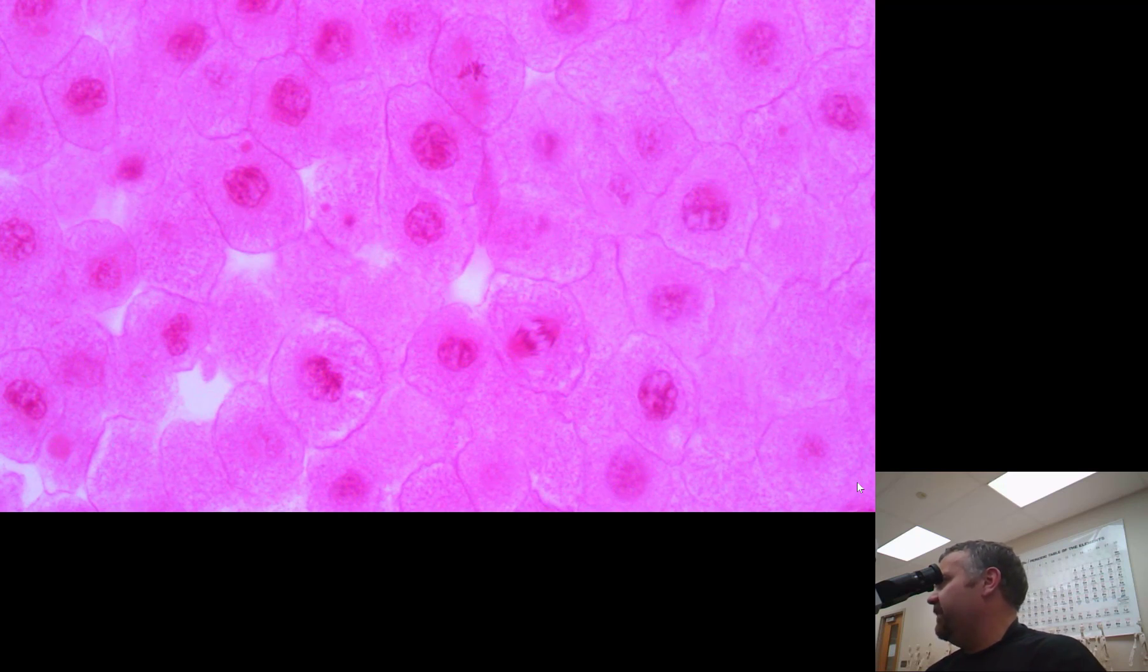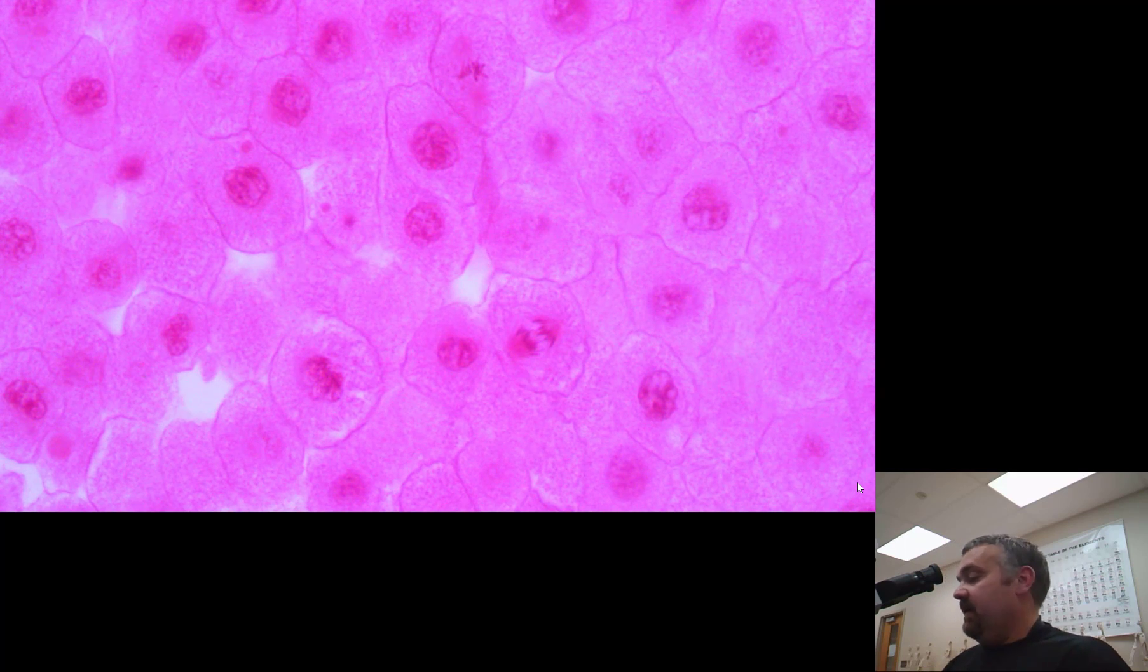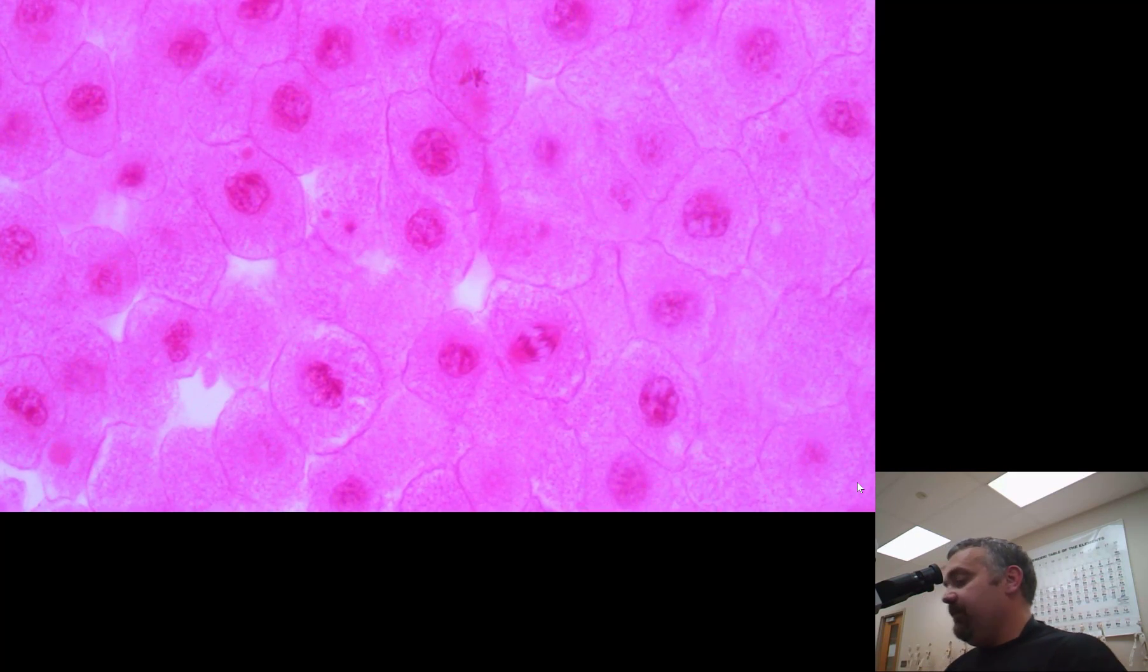To actually complete cell division, we would need the next step, which is cytokinesis. So mitosis is just the division of the nucleus. You guys can look around here, pause this video, and see if you can find other phases. If not, I hope you get a slide and do this for yourself.